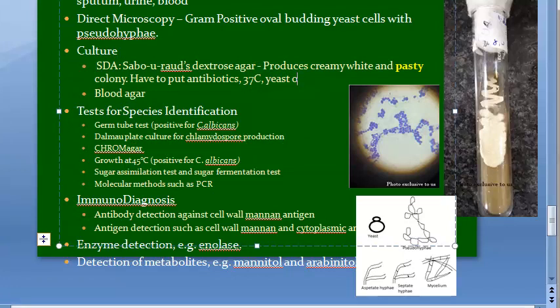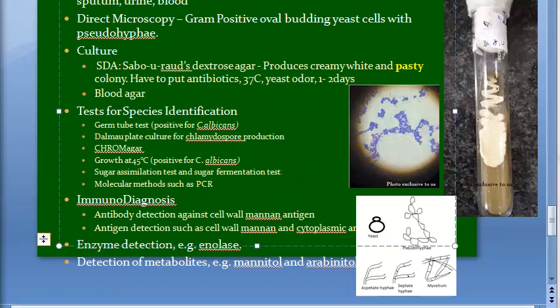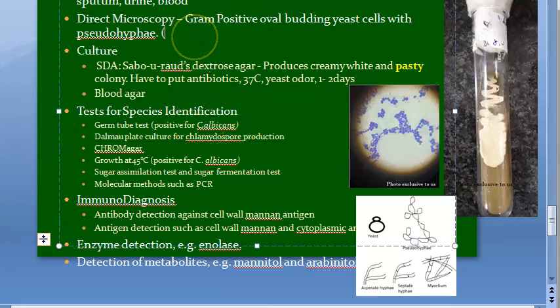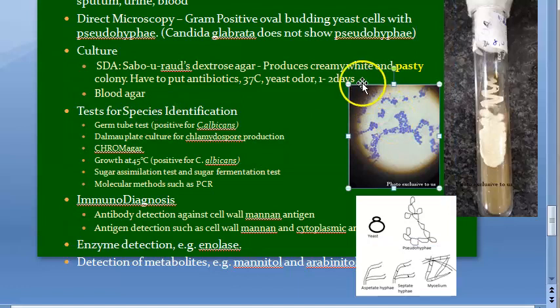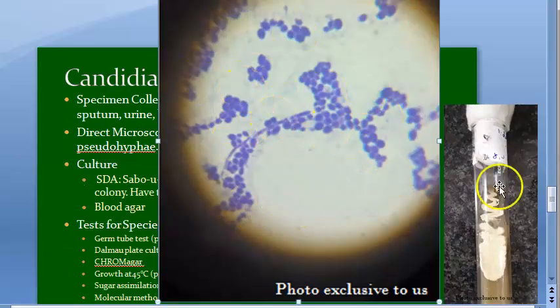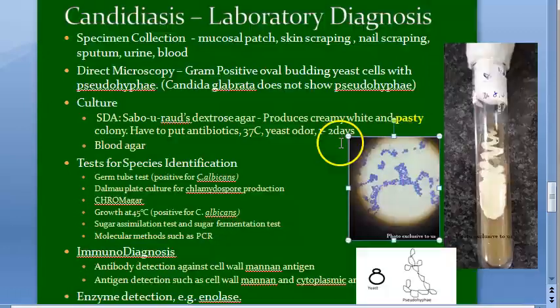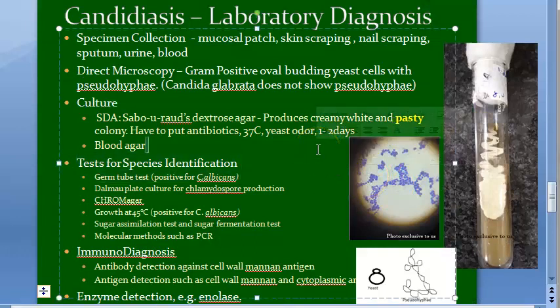Colonies grow within one to two days — similar to bacteria. Gram staining of the colonies shows gram-positive budding yeast cells with pseudohyphae, except for Candida glabrata, which does not show pseudohyphae. You can take these colonies and examine them with gram stain.